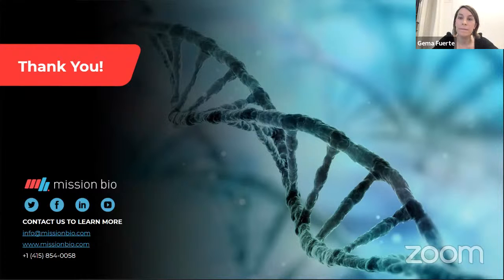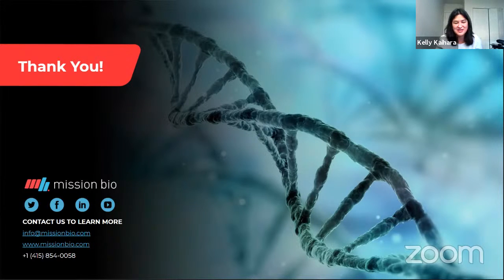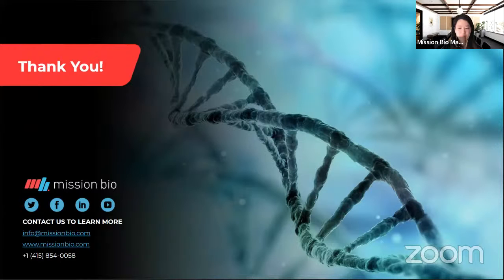Great. I would also encourage you, we have example data sets. When you download Tapestri Insights 3.0, it comes with a data set from our 45-plex on PBMCs. So I encourage you to play around there, as well as with the Mosaic Jupyter notebooks. There's an example data set as well that you can explore. That's great, because that was the next question.